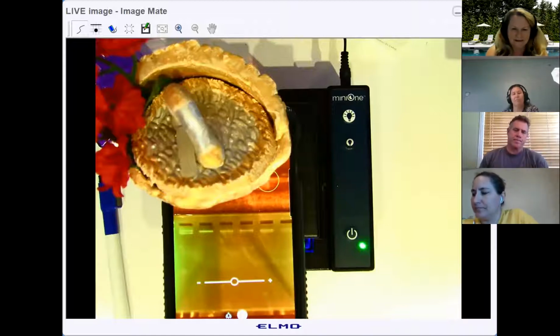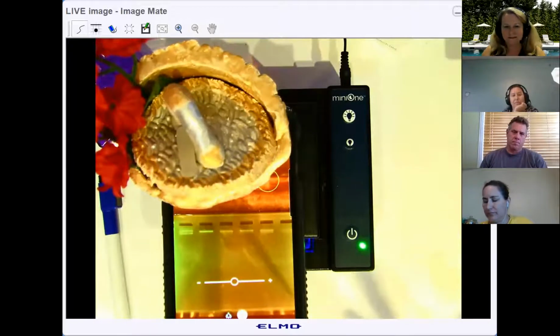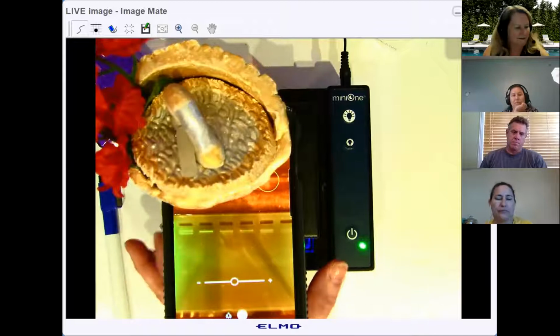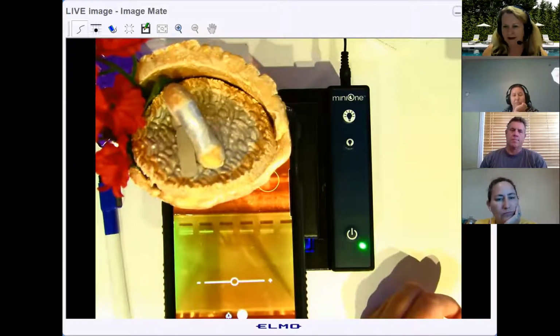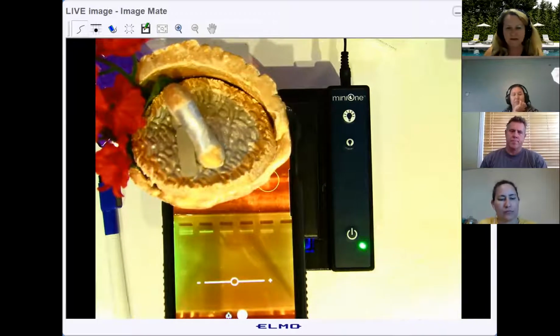And what's nice about this, and I don't want to sound like I'm selling this, but I just love that they have this little hood on it so the kids can put their cell phones and record it. And if they don't want to record it, they can just put their cell phones up there at the end. This is what I have them do in my classroom.